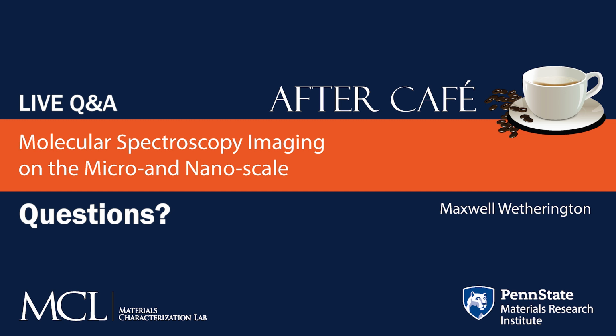If you have powders, just free powders, there's a number of ways for us to prep those materials. Some things might be a little bit more complicated. We have started looking at how we can look at multilayer films, so looking at microtoming or FIBbing the cross section. We've done some microtoming. We're planning to explore some FIB cross sections and see how we can look at the interface between layers, because that's certainly of interest for a lot of individuals.